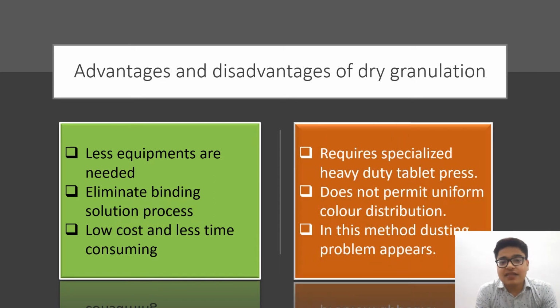Now, what are the disadvantages? The disadvantage is that heavy duty tablet press machines are required. It does not permit uniform color distribution, and also in this method, a dusting problem appears.